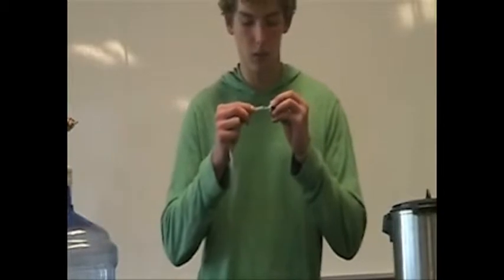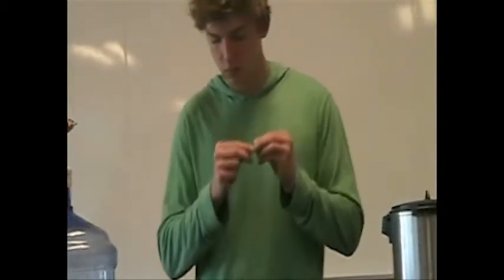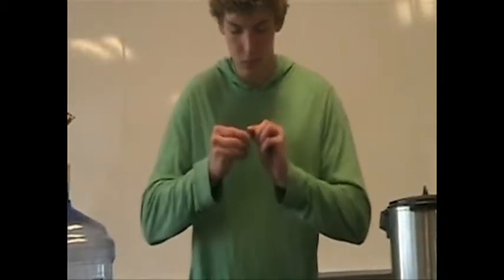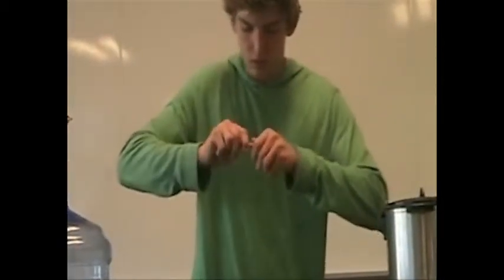Now we got that in there, we can slide this on to this side. Twist it right on there.